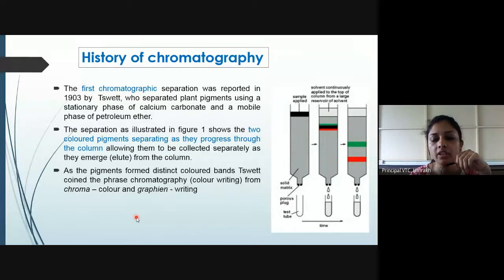If you check the Indian Pharmacopoeia 1996, you will be able to see that some of the drugs which were analyzed with UV or potentiometry are now analyzed through HPLC or GC methods. So these methods, HPLC and other chromatographic methods like GC, are used across the analysis of many drugs.